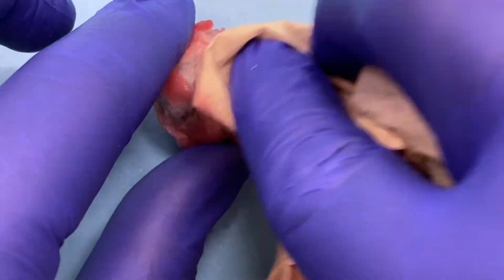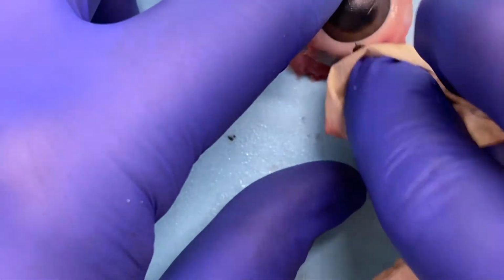Let's go ahead and dry that off. I'm going to dry off my tumor indicator as well.